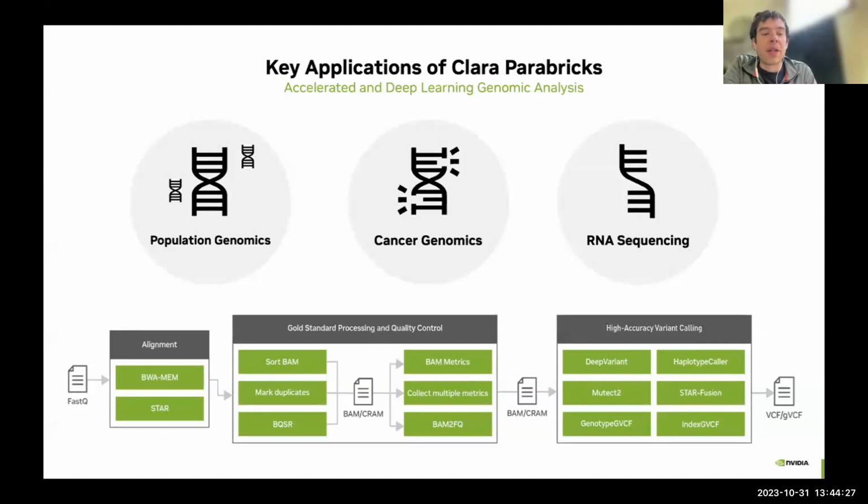This is all meant to support population genomics and cancer genomics, which usually focus on human samples. But in the hands-on portion, I'm going to be using Arabidopsis just because I am a plant person, and those are usually the references I know best. All of these are generally applicable. You essentially just have to re-index whatever genome you want to work with, and it'll still be blazing fast.